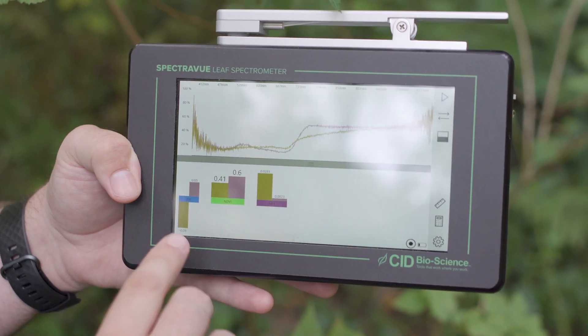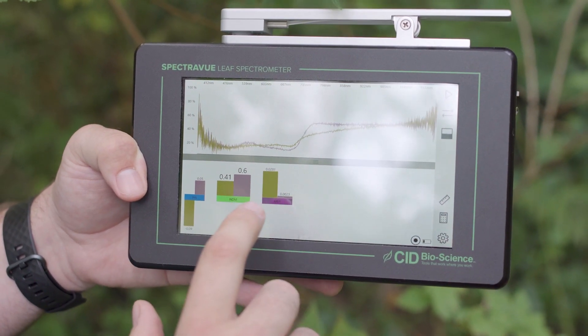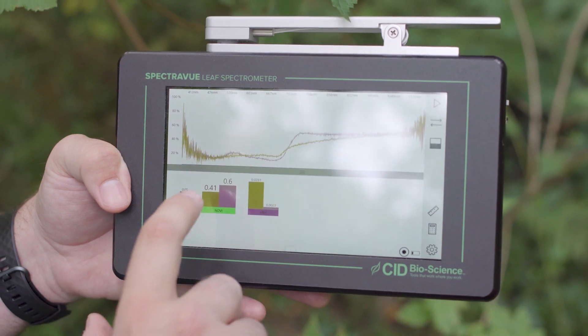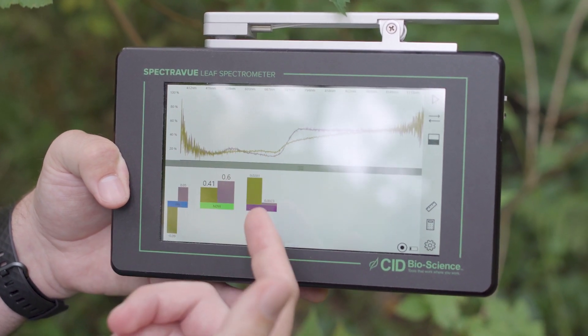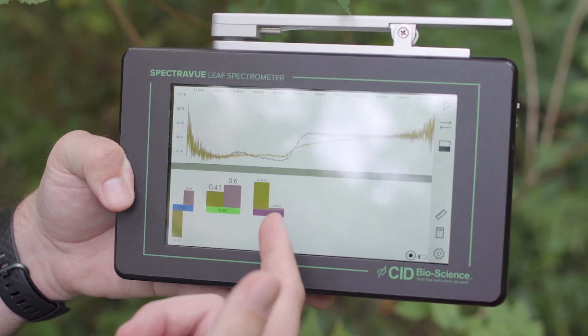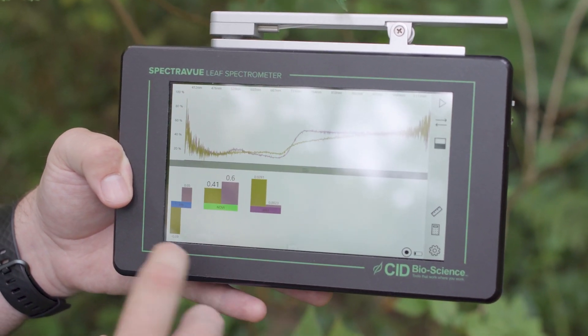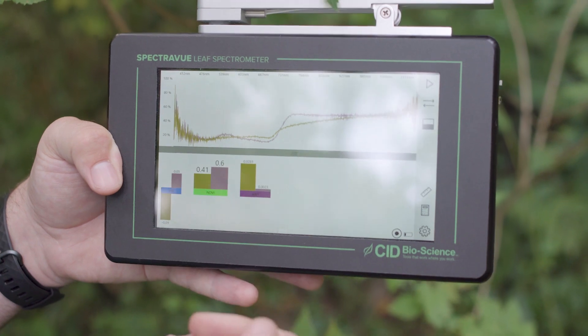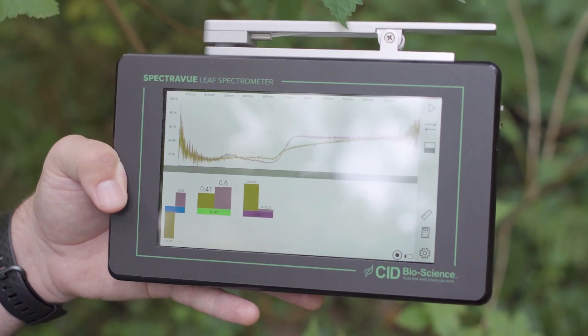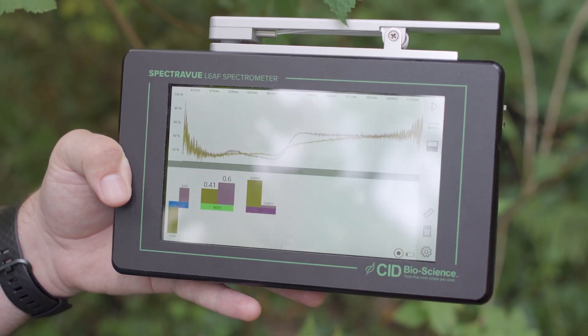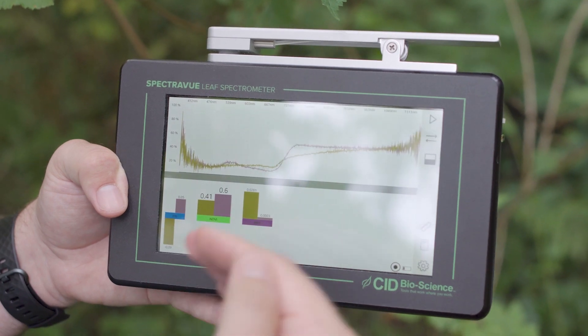And so with these numbers, what you can see off the bat is that the unhealthy leaf has a much higher anthocyanin content. It has a lower NDVI, analogous to lower chlorophyll content, and it also has a lower PRI, so the photochemicals are at a lower level than with the healthy leaf.